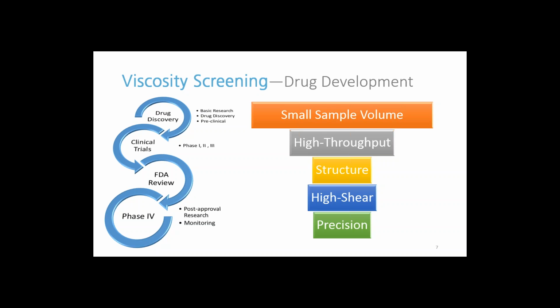When you move on into more intermediate stages, you might want to look into the application of the drug and to study things such as, for example, injectability. You're going to have a requirement of high shear to do those testings to determine the viscosity of your formulations at the shear that is relevant for your injection process, for example.